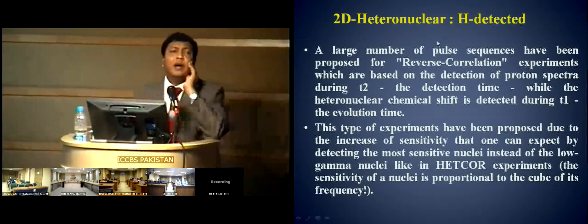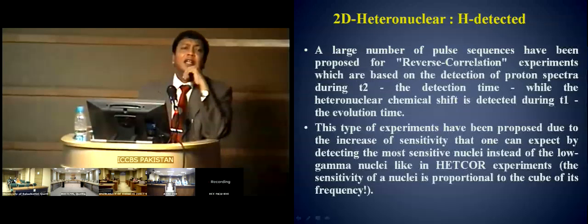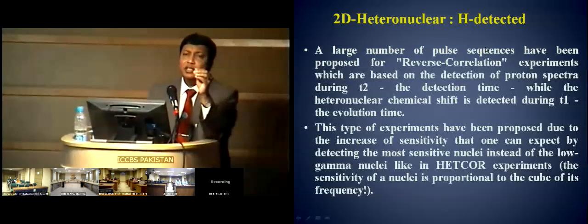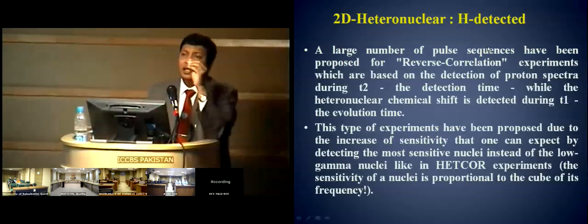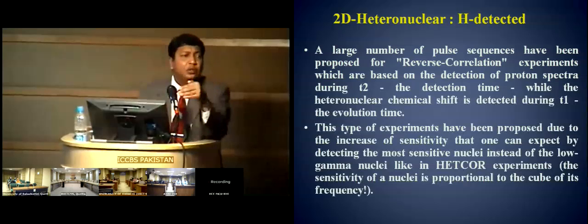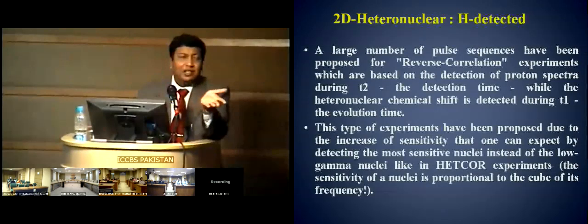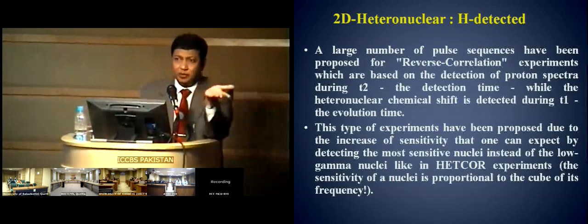Then somebody said, why do we really need to? There was an understanding at that time also that when we do a normal polarization transfer, INEPT, the basic fundamental experiment of polarization transfer, the first polarization transfer experiment which was designed, in which you have a proton as a source and carbon as a recipient detected nucleus, which receives the polarization from proton.